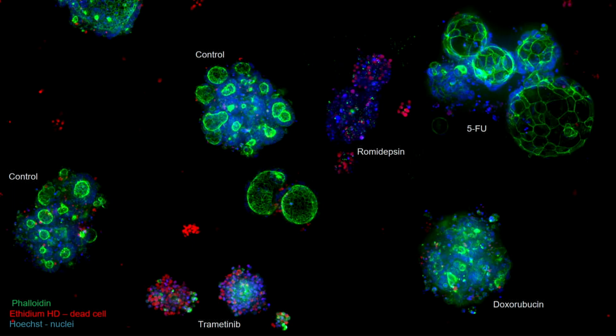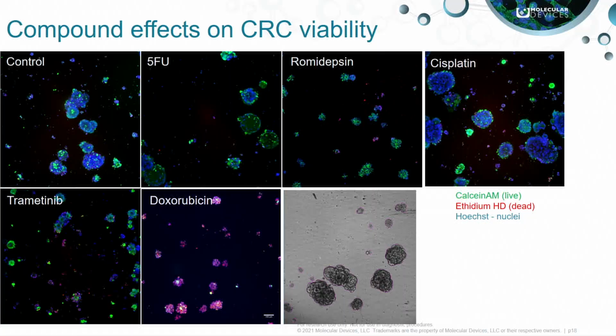And this is what I think we're trying to capture when we do an image-based profiling experiment over here. And so I'll come back to this a little bit later, but just very quickly, just to show you how you can do viability assays.